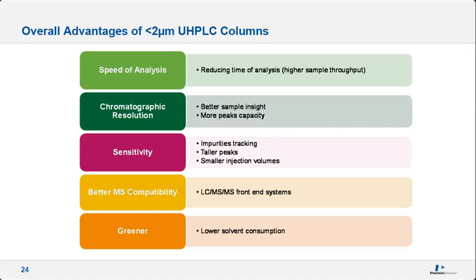Better mass spec compatibility because of the lower flow rate requirements. And finally, because of lower solvent consumption, the smaller particle columns are greener.